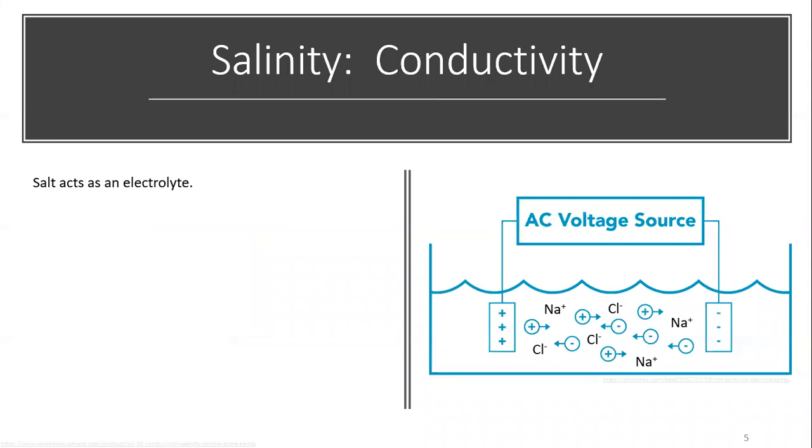Because salt acts as an electrolyte, the measured conductivity of seawater is directly proportional to the concentration of dissolved ions. In other words, saltier solutions will better carry or conduct electric current.